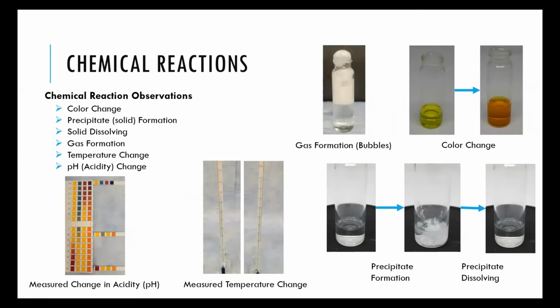You're going to be looking at 4 or 5 different reactions in small test tubes and determining, did a reaction occur? Look at the observations, look at the physical things you can see or feel. Temperature change is something that you could feel in the test tube. Is it getting hot? Is it getting cold? Things like that. So this would be the first part of the experiment.